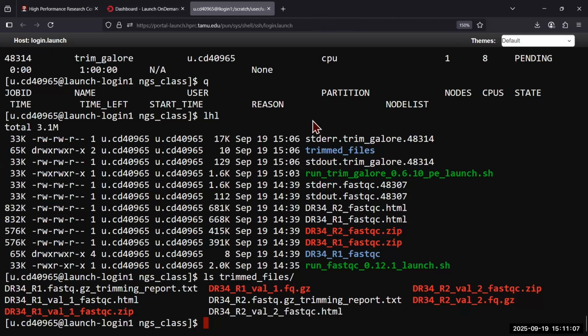Whenever something is compressed, it takes it and compresses it, kind of like when you zip a file in Windows, to make it smaller. Basically the output is compressed so you don't take up so much disk space. Because a lot of the utilities can read a zip file, you can just unzip it as it reads it. That way you can save on disk space.